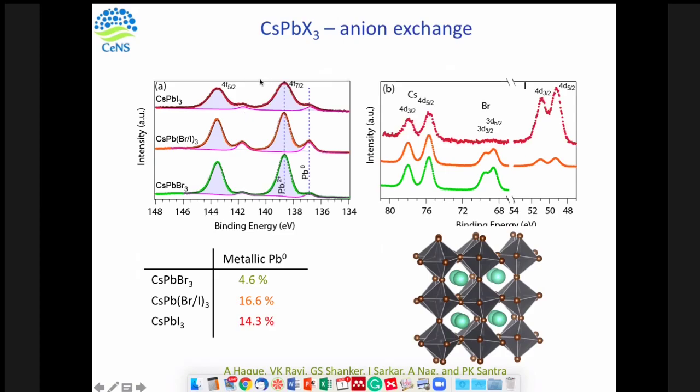Okay. So it took you half an hour just to get that section. Yes, exactly. Interesting. These are very high quality XPS data. If you choose lead 4d, then probably the time will be different to get the same quality of data because the photoemission cross section will be different. Right. Okay.